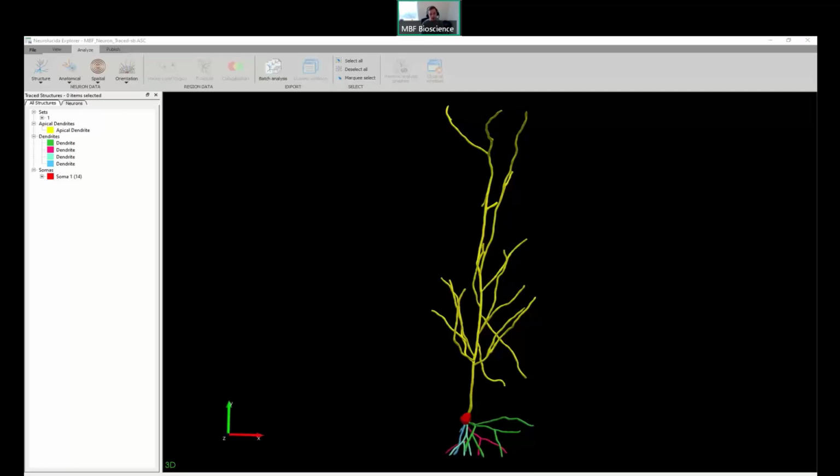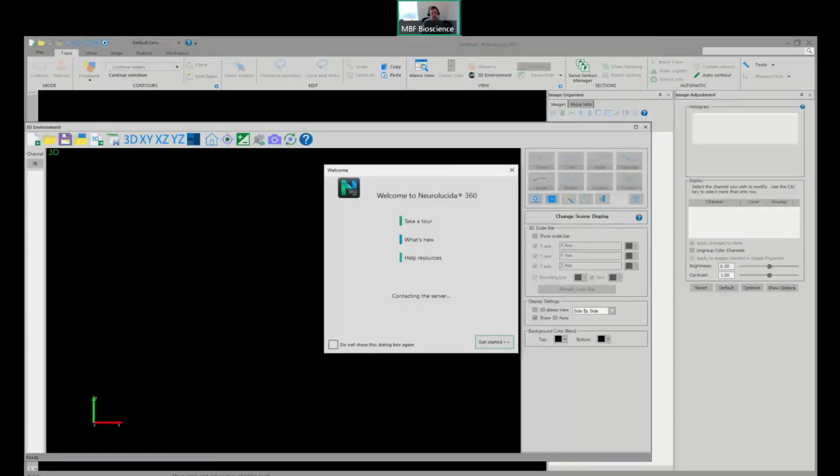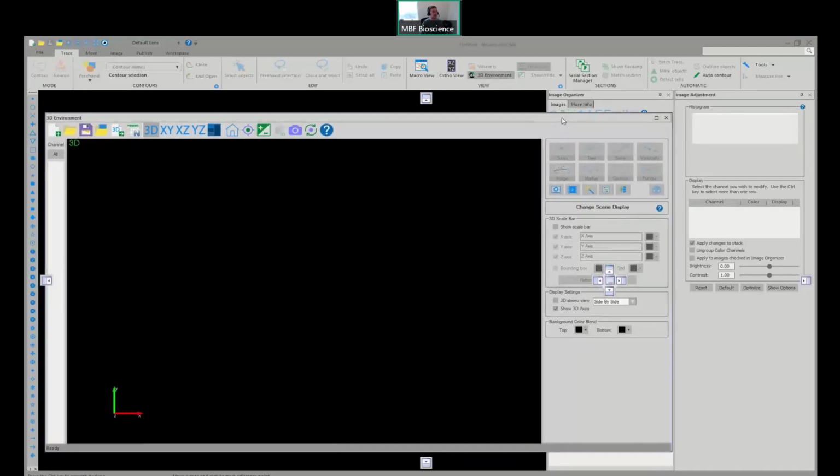Most of the images that we use so far, or all of them so far, have had the image scaling embedded within them. But that tends to not be the case when we use converters like Fiji or some other freeware that's out there. This is also a fantastic opportunity to plug Microfile Plus, the MBF Bioscience converter. It works fantastic, especially with large image data sets, whether you're working with multi-channel data to compile into an image stack, or whether you're working with a simple stack-to-stack conversion.